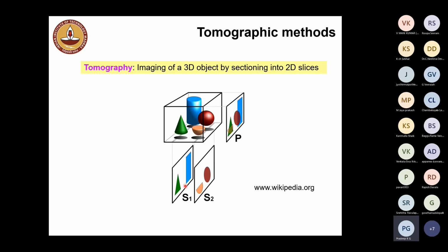By adding all the slices one after the other, you can three-dimensionally reconstruct whatever is there in this original volume and say this is a true representation of three-dimensional imaging. That means anything that you have at the nanoscale has a specific morphology. If you do only a single projection imaging, you may not get the full description of that particular morphology. But if you, on the other hand, do the slicing and look through the different slices of the same nanoscale feature, then we have a much better chance of identifying the real description of the morphology of the features. And therefore, we will now be in a position to put these things together and see them in a more realistic, descriptive way.